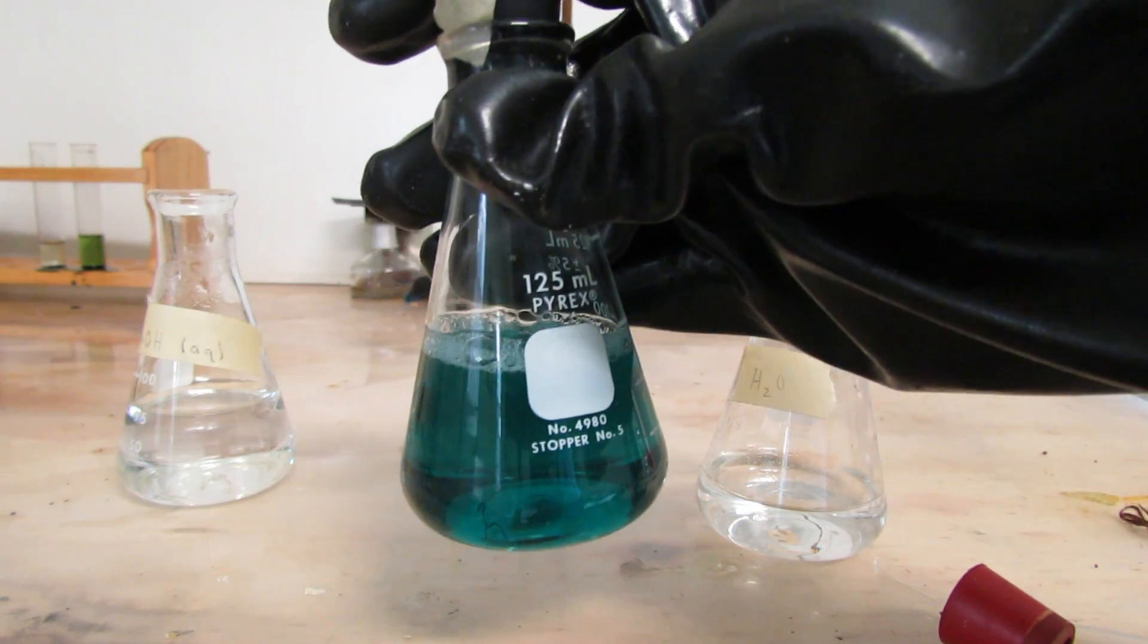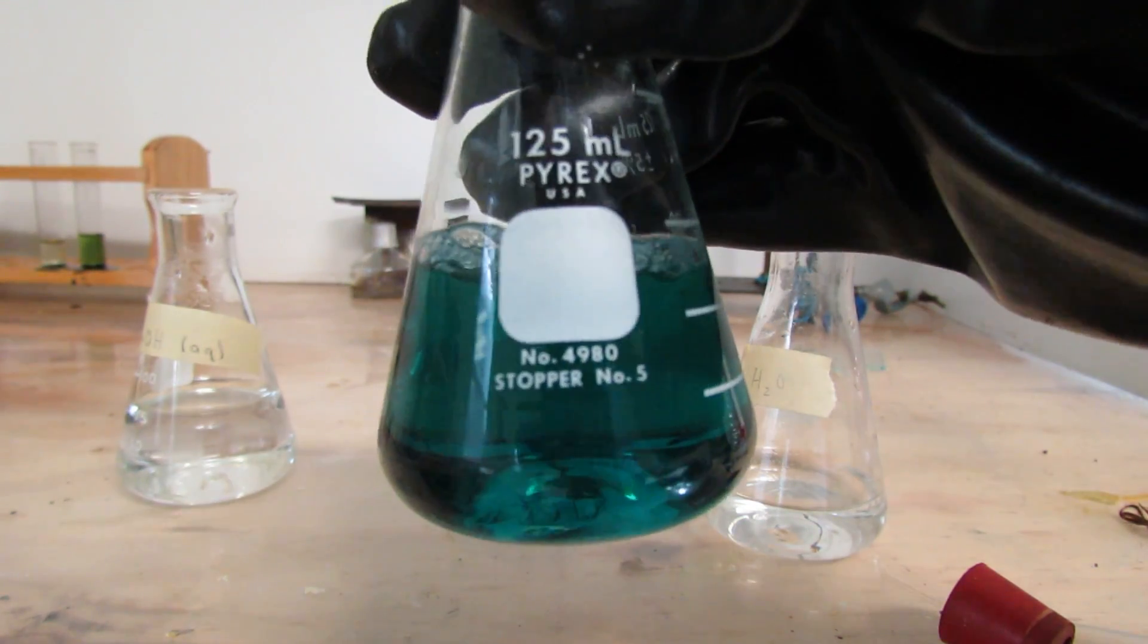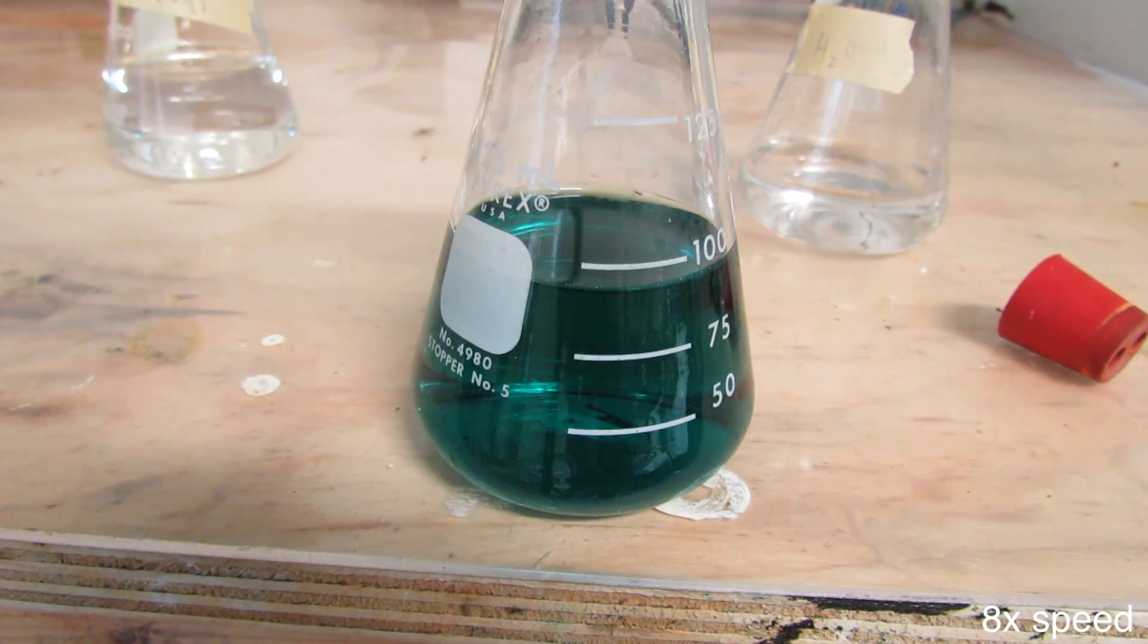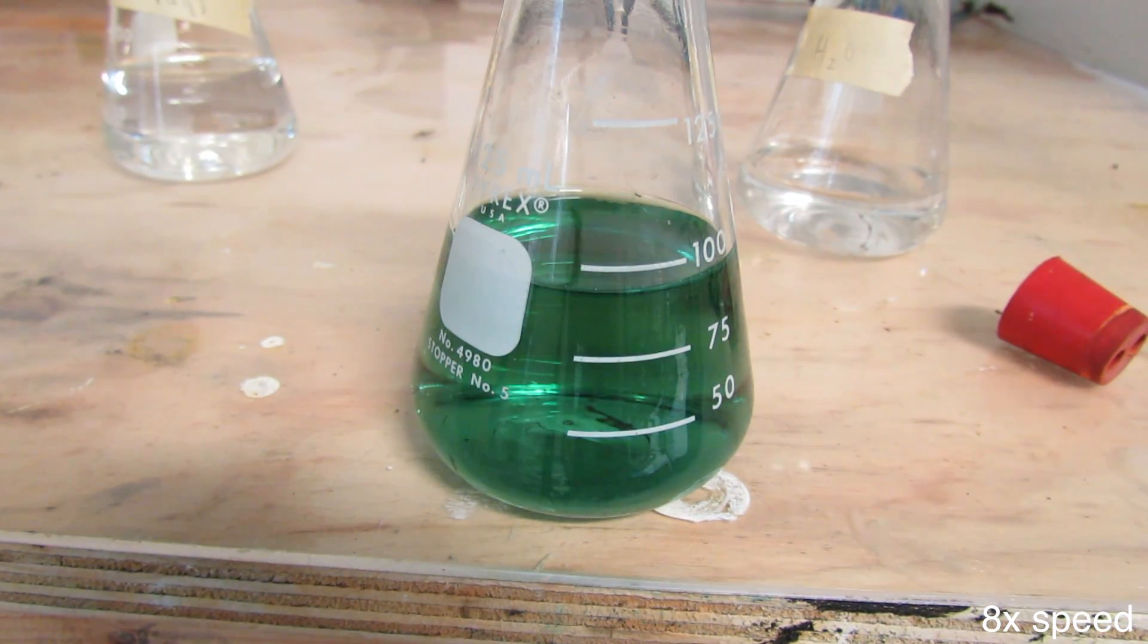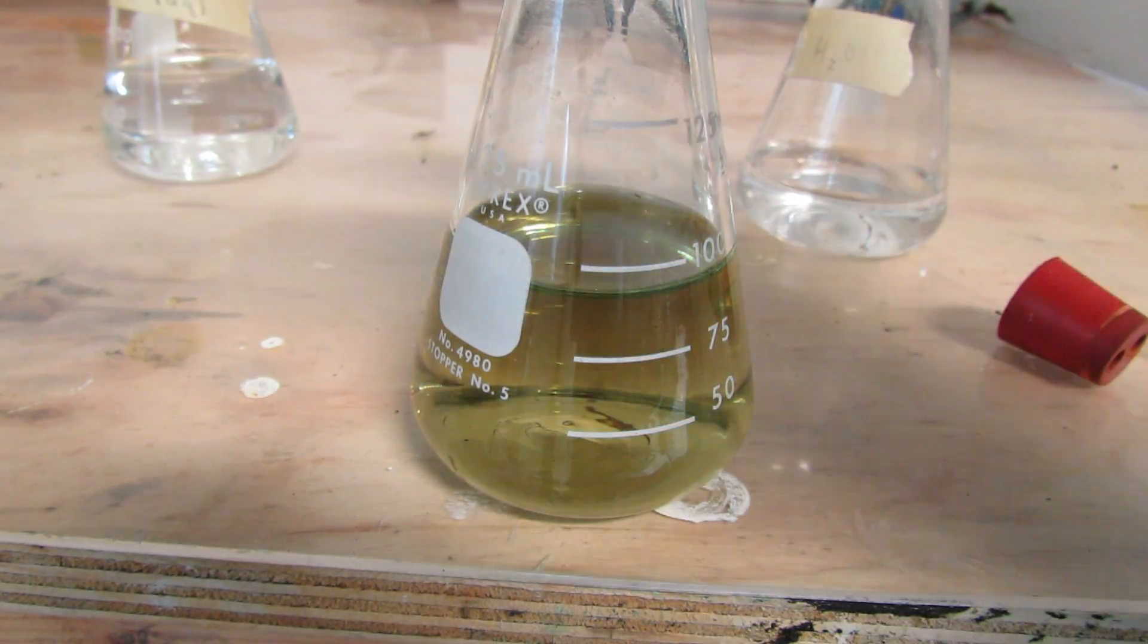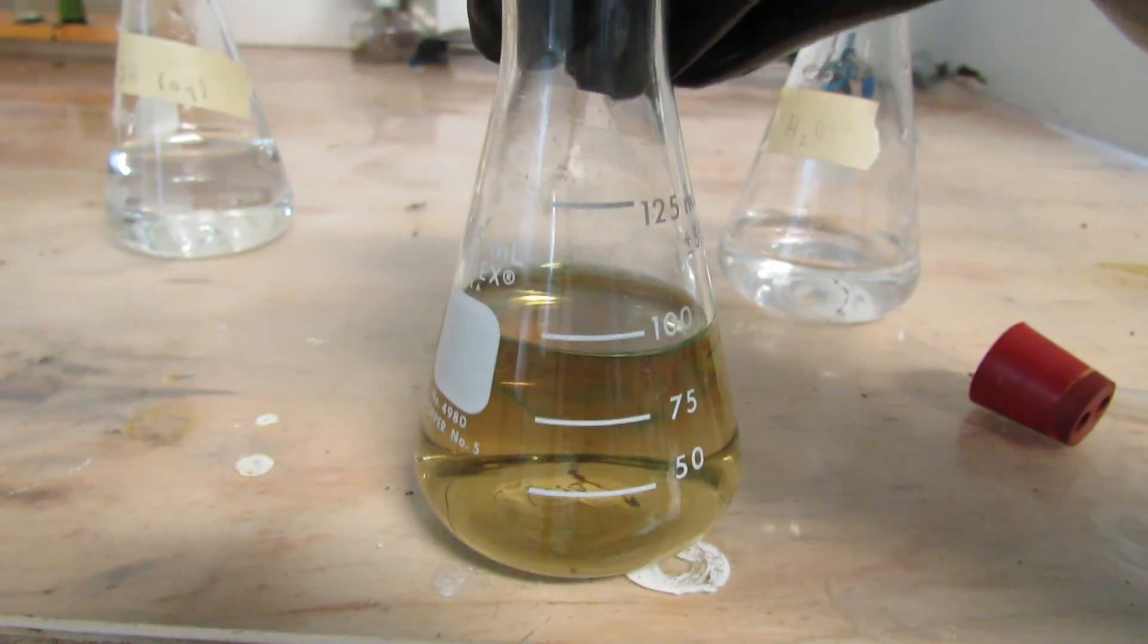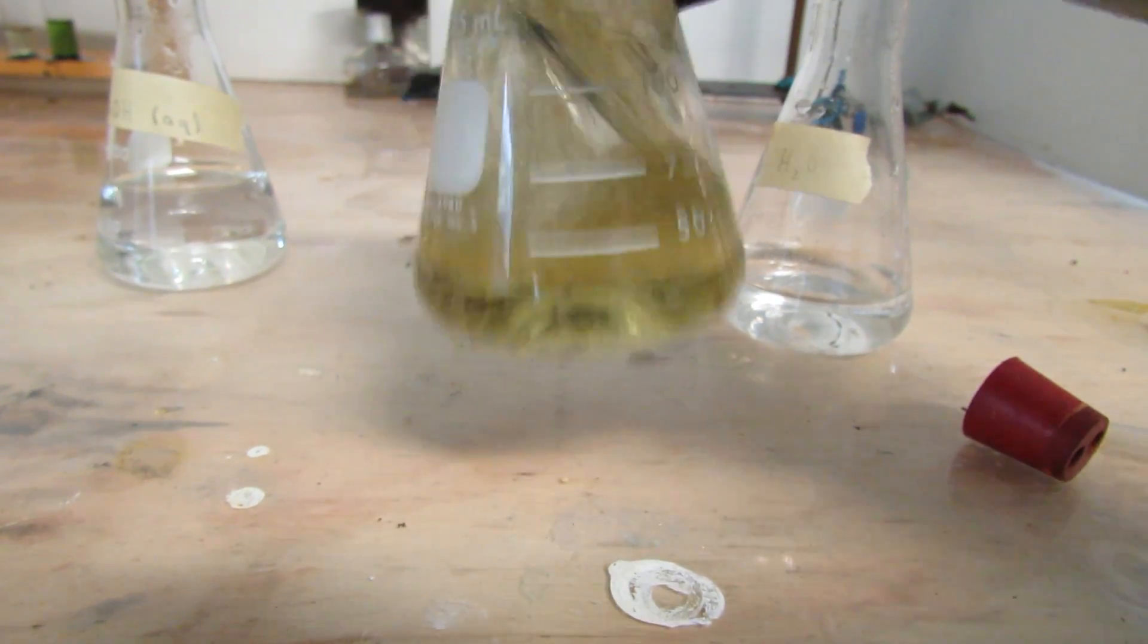As you can see, it turns back to the blue color of the methylene blue. Now, if we let this sit, it will eventually go back to the brown color of the syrup. Once this happens, we can just shake the flask again and the reaction starts over.